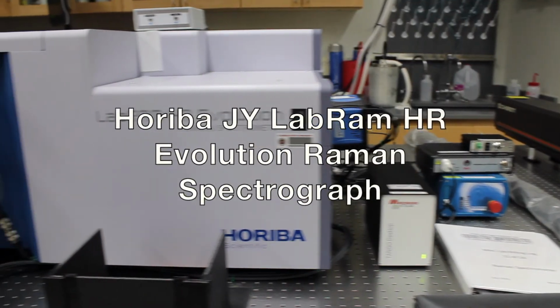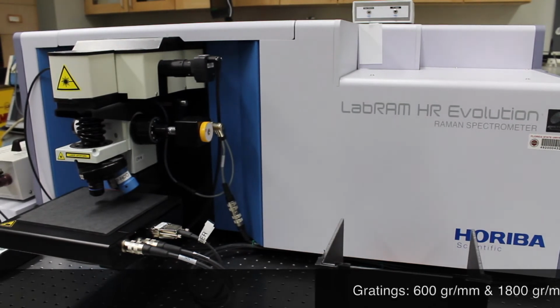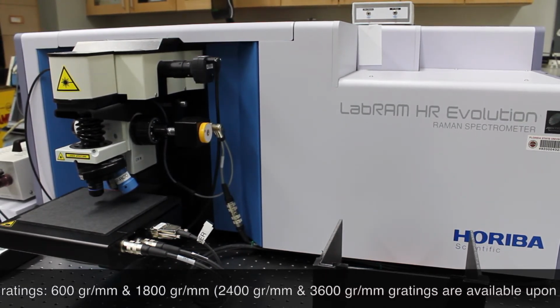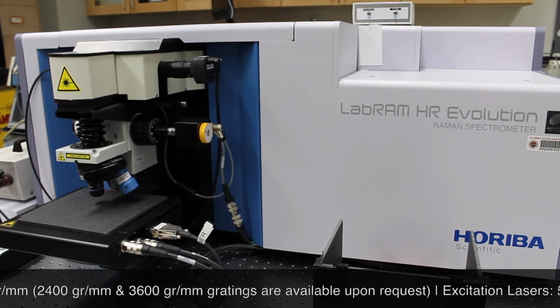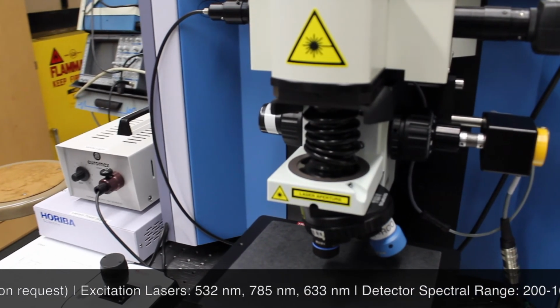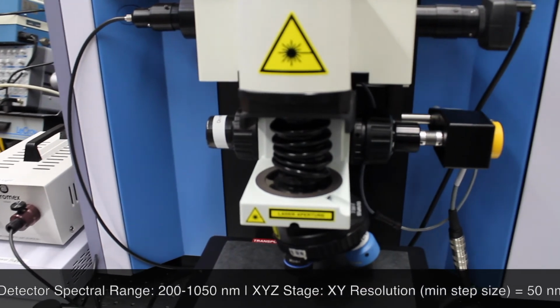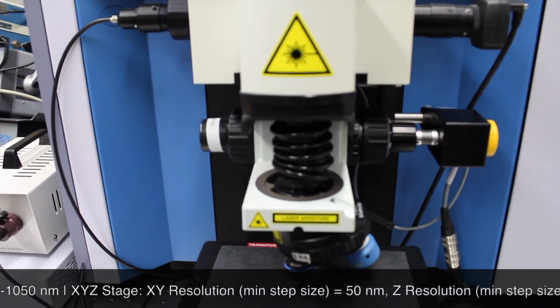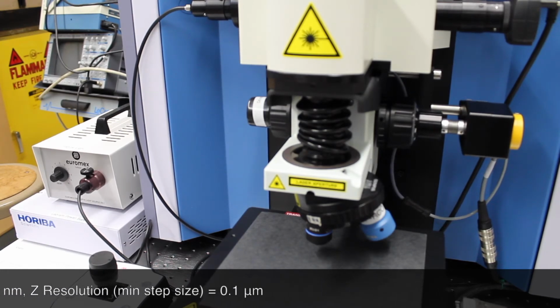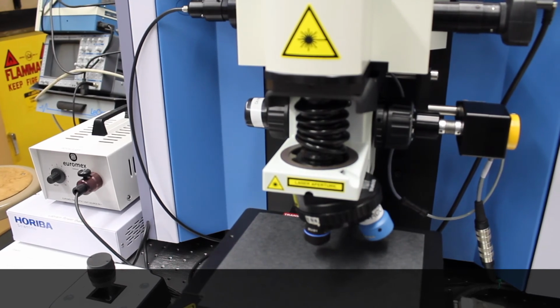The microscope-based Raman spectrograph is a fully confocal, high-resolution spectrometer that is well suited for a broad range of applications. The instrument is coupled to 3 excitation lasers, has 2 selectable gratings, and uses a charge-coupled device camera for detection. The true confocal microscope, along with motorized XYZ stage, offer high-resolution 2-dimensional and 3-dimensional Raman images. Accessories are available for various needs, including optics for polarized Raman spectroscopy and a setup to measure liquid or large samples in free space.